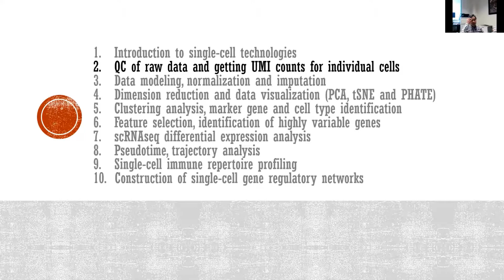At the end of the lecture, my student, Daniel Osoro, will have a live demonstration of using the single-cell pipeline from 10x Genomics, called Cell Ranger, to do this on the computer, and you'll see how exactly that pipeline will work.